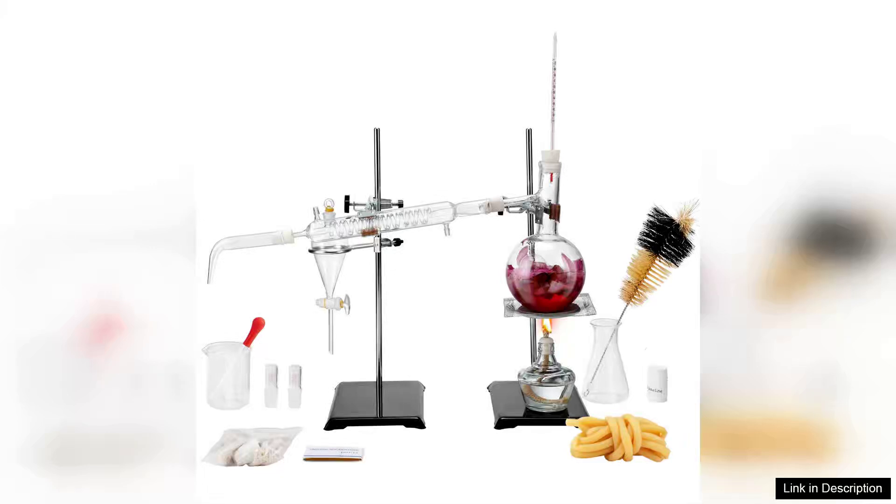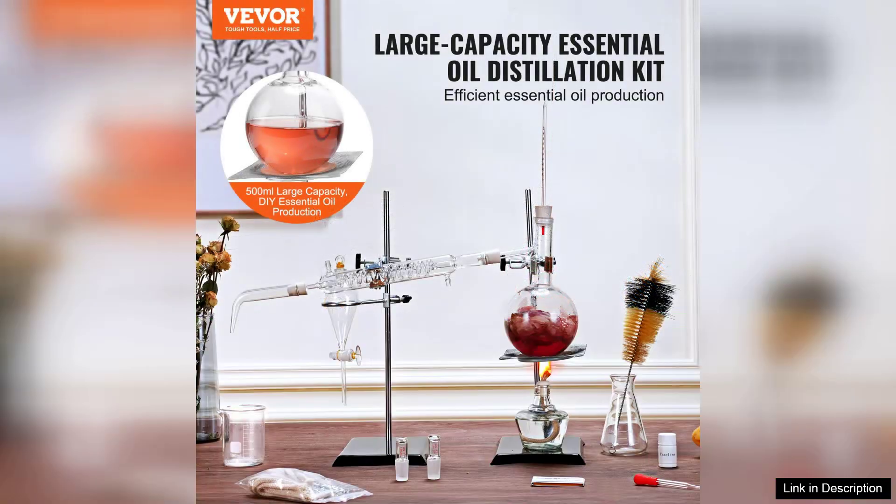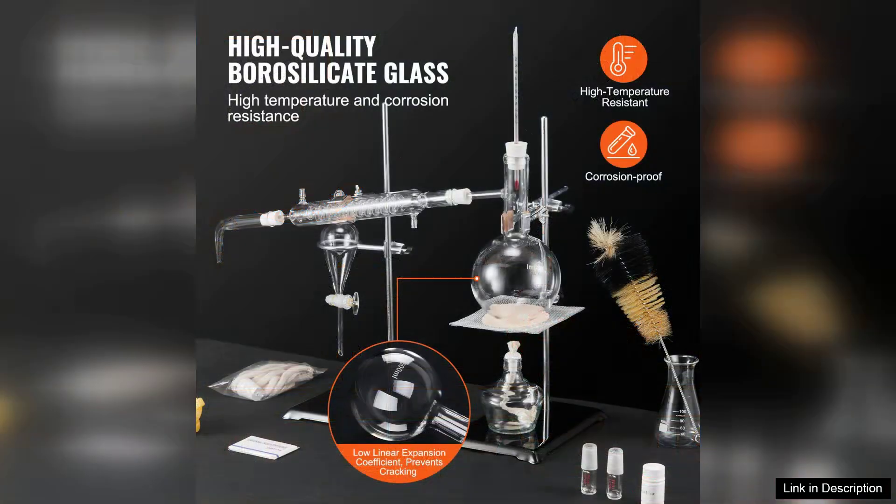The Veva Essential Oil Distillation Kit is a commendable choice for both beginners and seasoned enthusiasts in the realm of essential oil extraction. This 500ml distillation apparatus is designed with practicality and efficiency in mind, making it an excellent addition to any home lab.